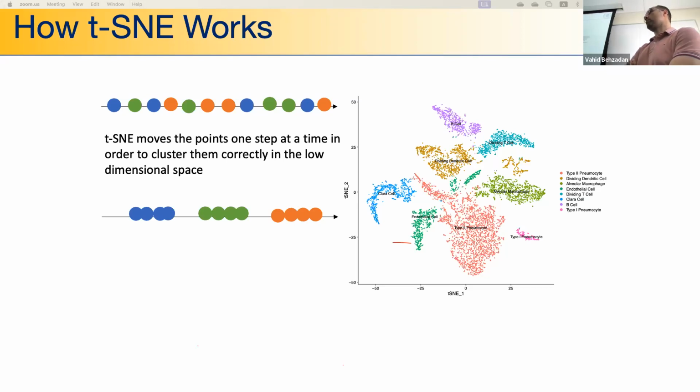isn't the task there to see what expressions of genes, in other words, what cell types are involved in the emergence of disease? Not cell types. You're looking for genes within a cell type. So these samples are the same cell type, right?